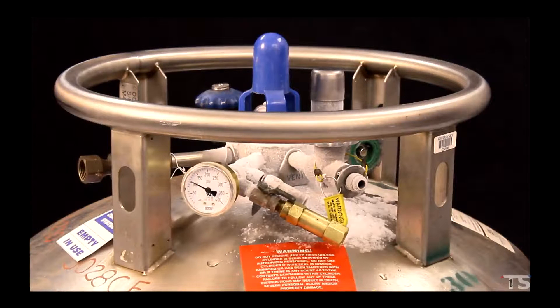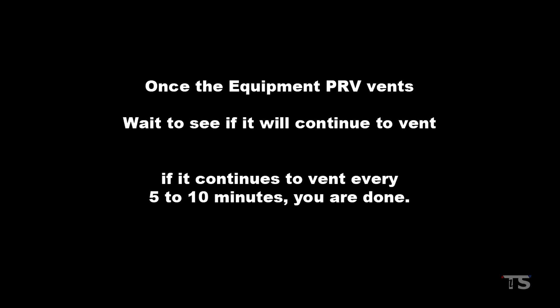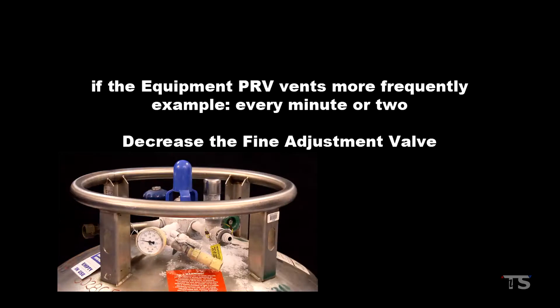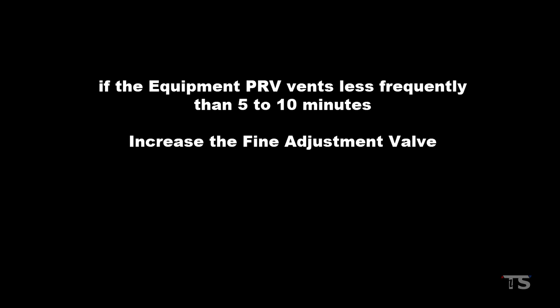Once the equipment PRV vents, wait to see if it will continue to vent. If it continues to vent every 5 to 10 minutes, you are done — you've correctly set the dewar pressure. If it vents more frequently, say every minute or two, you will need to decrease the fine adjustment valve. If it vents less frequently than every 5 to 10 minutes, you may need to increase the pressure.